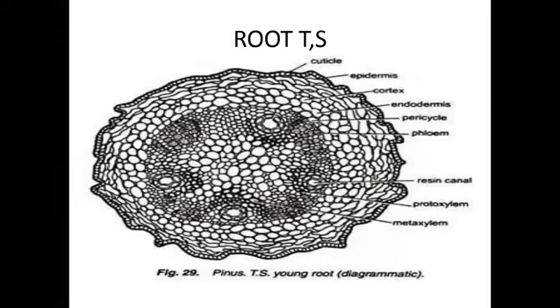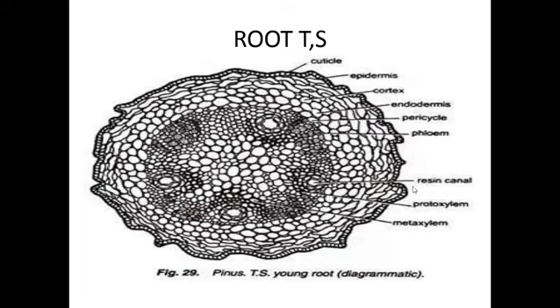Below the pericycle, vascular tissues are arranged in a radial position. The vascular tissues are called phloem and xylem, and the xylem and phloem tissues are arranged in a radial position. The xylem is of two types: one is protoxylem and one is metaxylem.